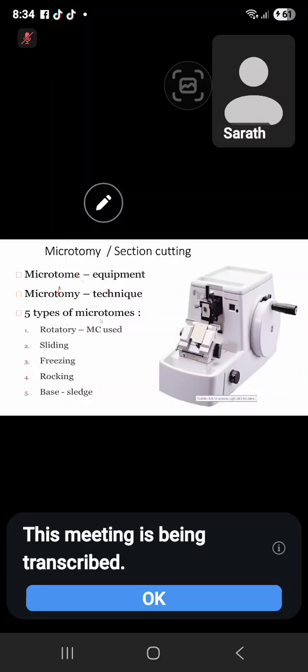Then microtome, section cutting: rotary, sliding, freezing, rocking, base sledge. Mainly these 5 types, but nowadays there are some more microtome types. In a Sri Lankan setup, they are using the rotary type, that is rotating. This is a wheel, this is a handle. By using this knob, you can control the thickness of the section. This is the block holder. There's a block here. Angle can be changed by these knobs. And the knife is kept here.